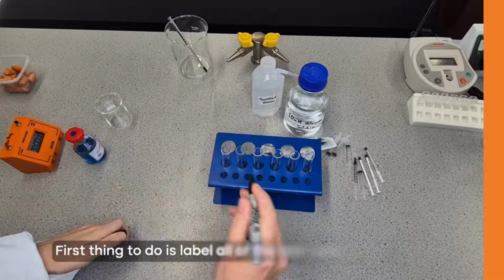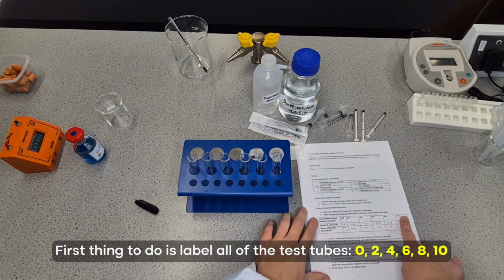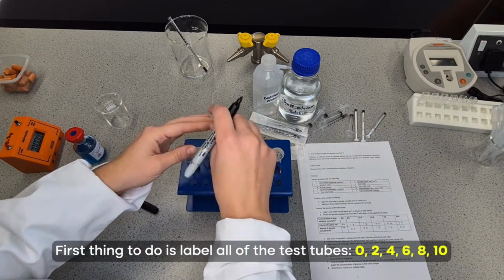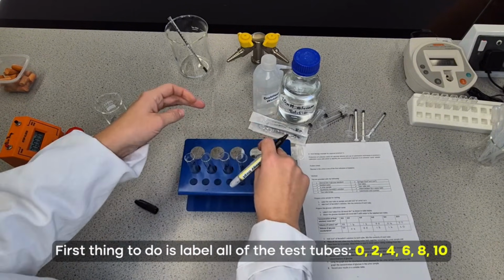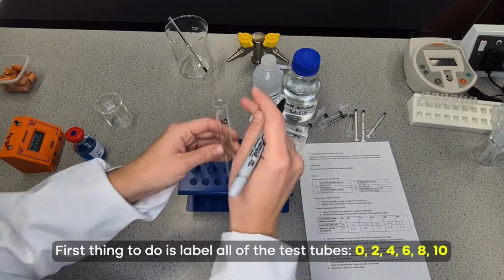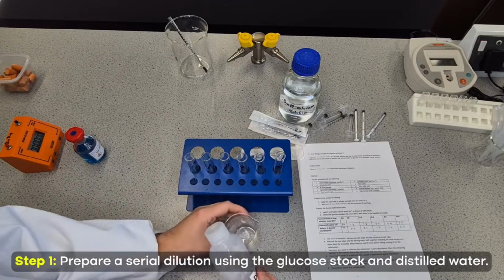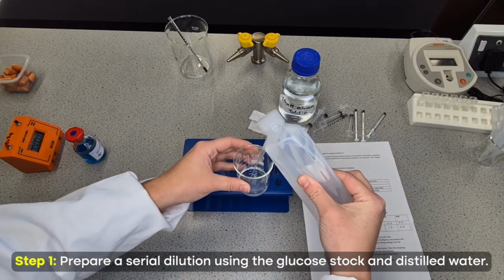And the first thing I'm going to do is label all of my test tubes. So these are the different concentrations that I'm going to be making. So that's what I'm going to label. I've got 0, 2, 4, 6, 8, and 10. I'm going to put my distilled water into this beaker, because otherwise my syringes won't be able to fit into this bottle.